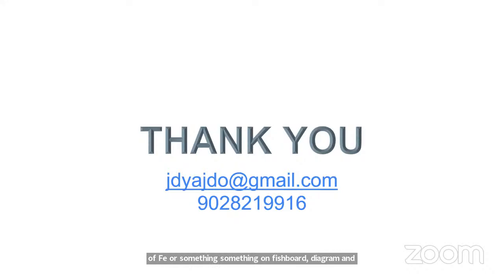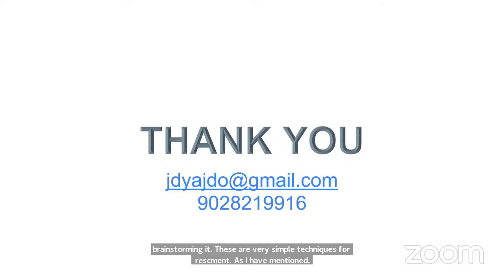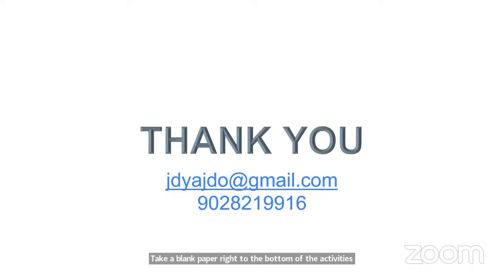As I have mentioned, take a blank paper, write down what activities we are performing in the laboratory, and find out which activities are where errors can happen. Also find out which activities you should prioritize, which are more important, which are more critical, and take actions. It is not mandatory to use any hi-fi techniques or terminologies while performing the risk assessment.